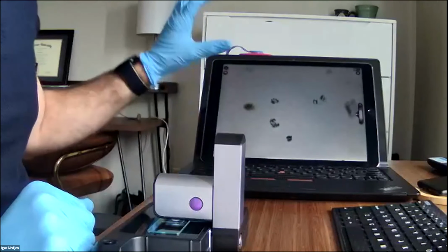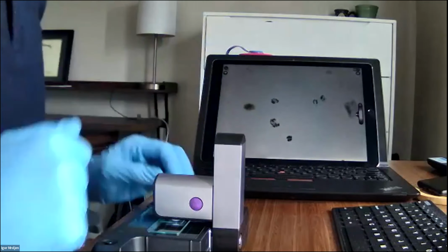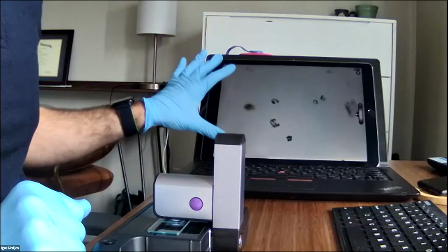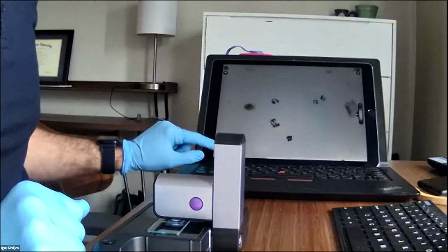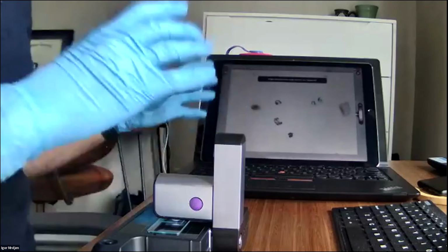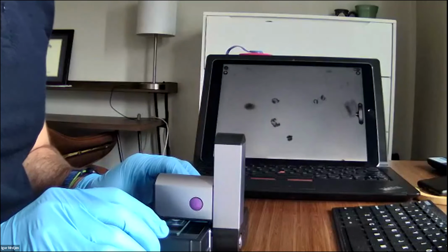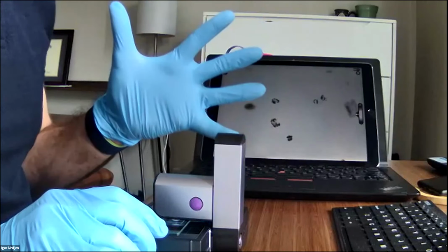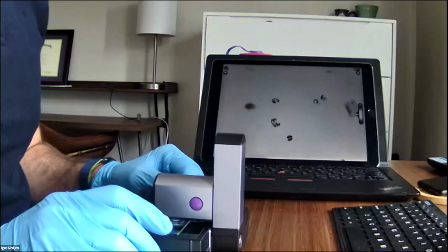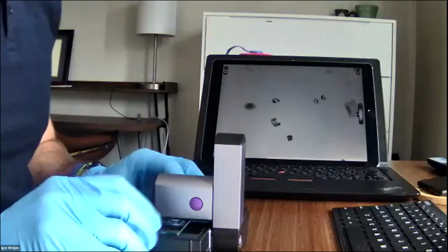And I realize that it doesn't look fantastic right now because you're looking at a screen of a screen, right? But when you're satisfied with your focus on a certain image, you can press the photo button, and the photos are taken and saved into a special folder on your device. And so what we recommend is taking 5 photos per slide and processing 2 slides for a total of 10 photos that you will upload to the BloomOptix app.